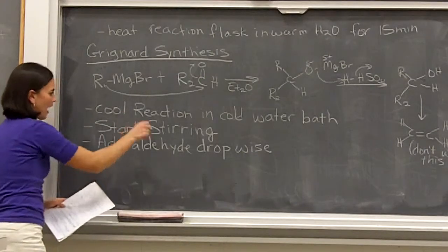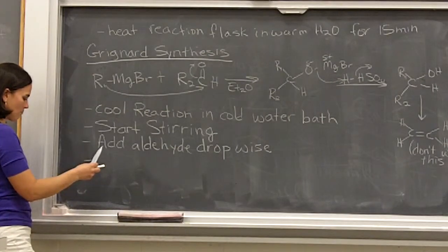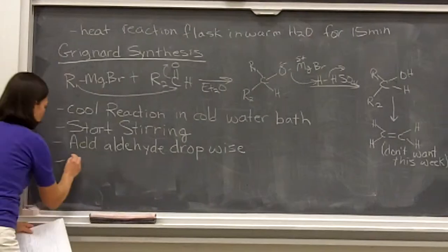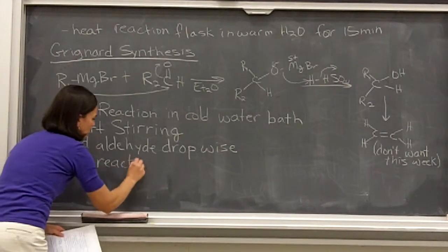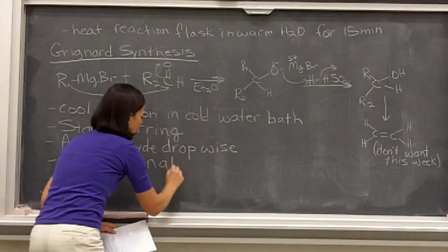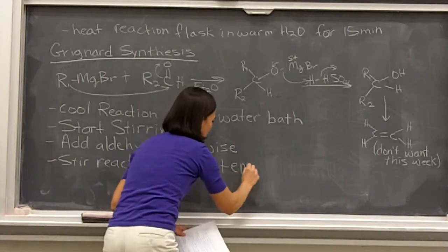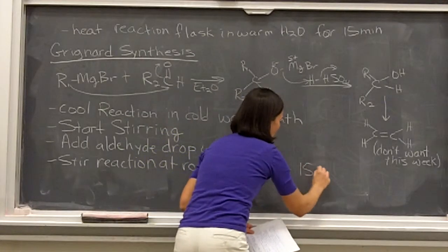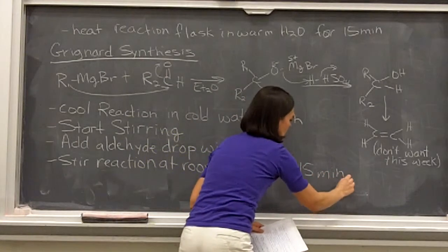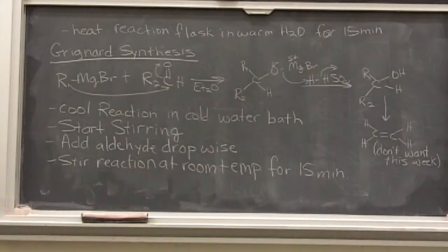Then, after your dropwise addition, you're going to stir the reaction at room temperature for 15 minutes. So we still haven't gotten to the quench. We have just added the aldehyde. During this 15-minute stir, get this solution ready, okay?